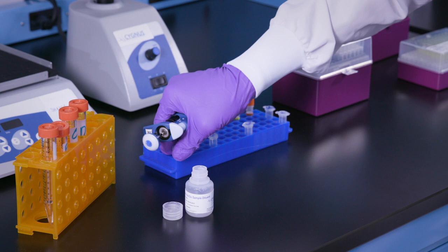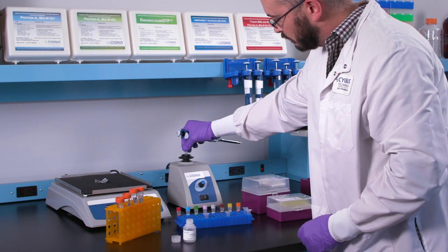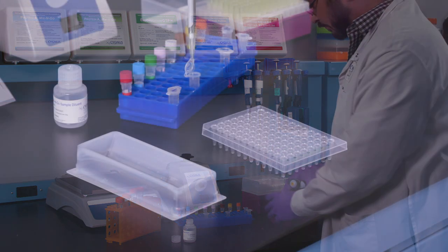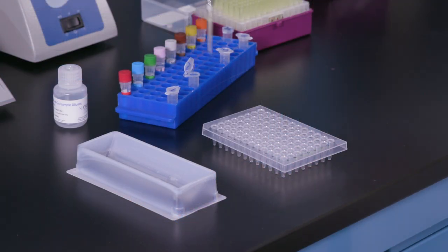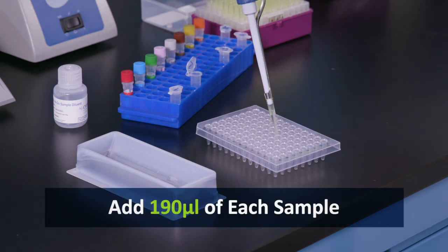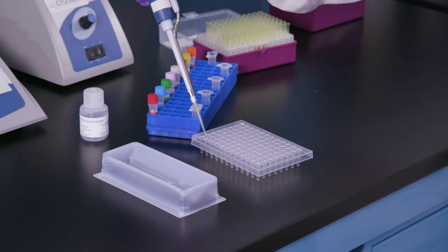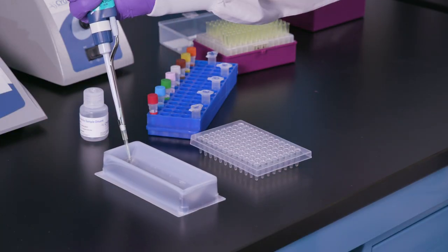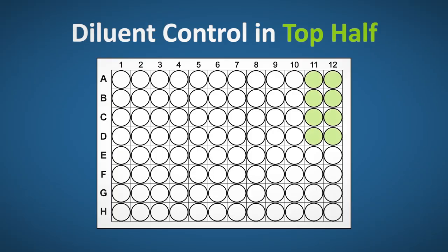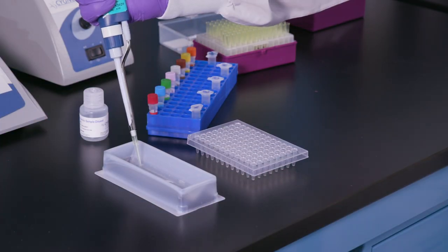As you can see here, samples one through four have already been diluted to the minimum required dilution. Add 190 microliters of each sample to its respective well in row A and row E. The last two columns are diluent control in the top half of the plate, and a spike control in the bottom half of the plate.